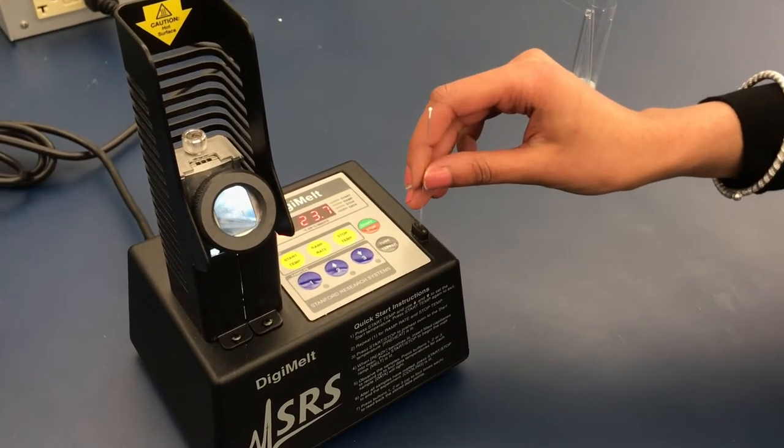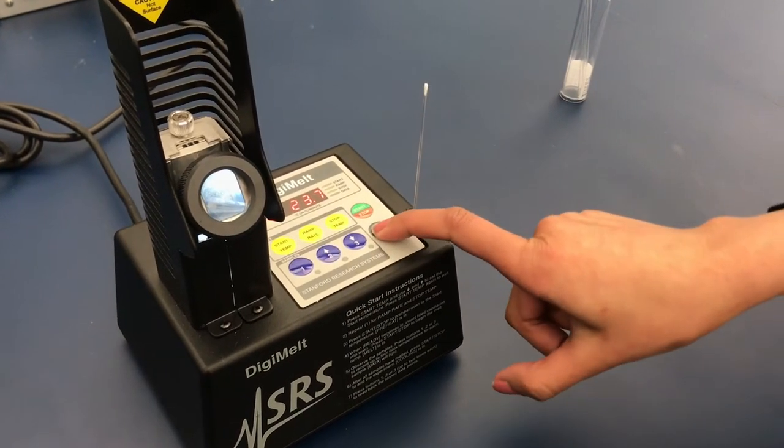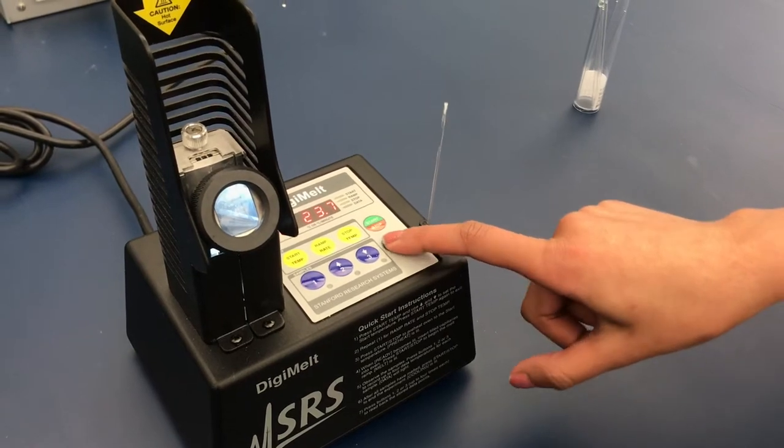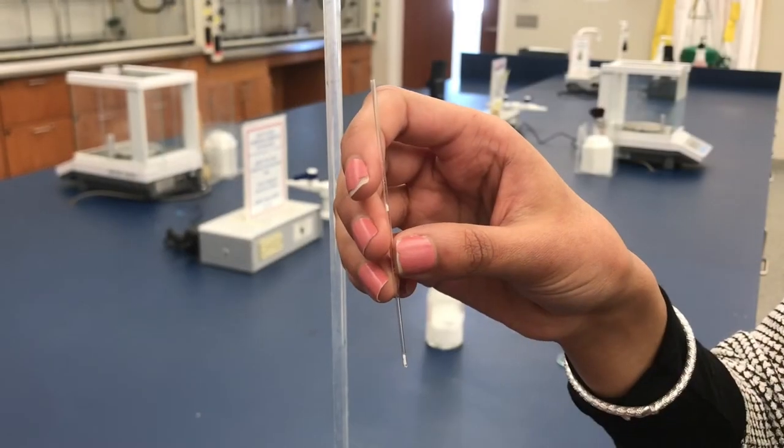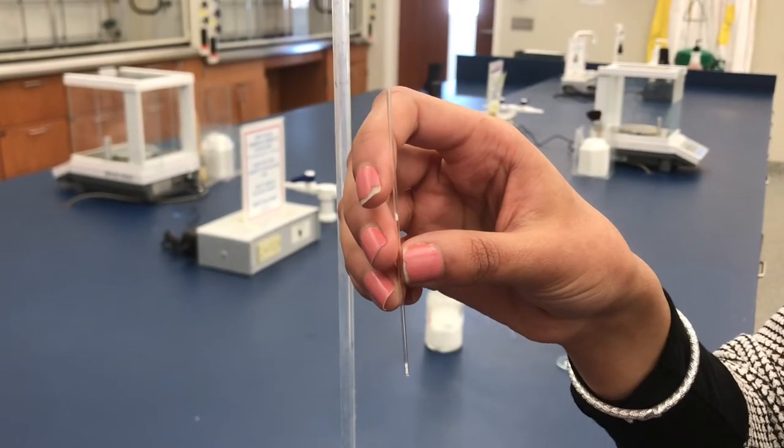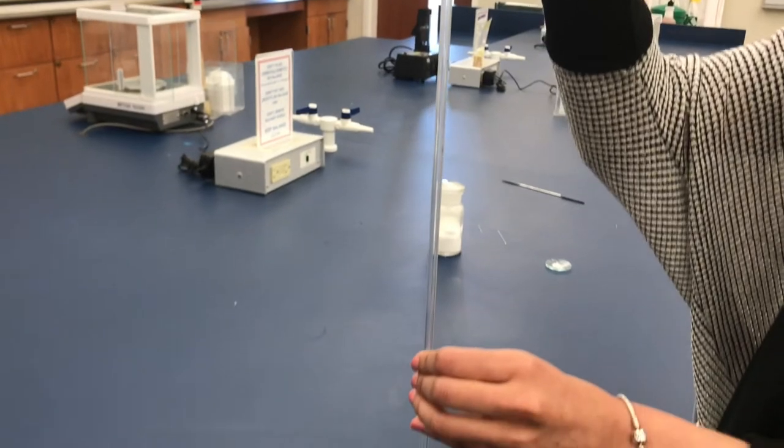Now place the capillary tube in one of the three tube tapper holes and press the button labeled tube tapper. This will bring down the solid to the bottom of the tube. You may have to press it a couple times before this happens. If this does not work, then you may use a glass rod to drop the melting tube through.